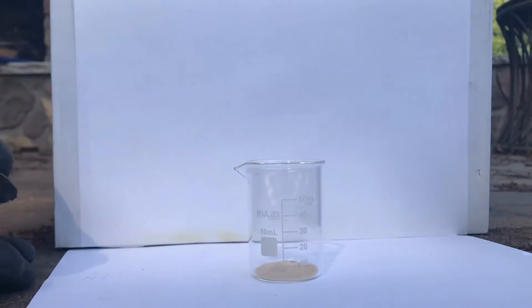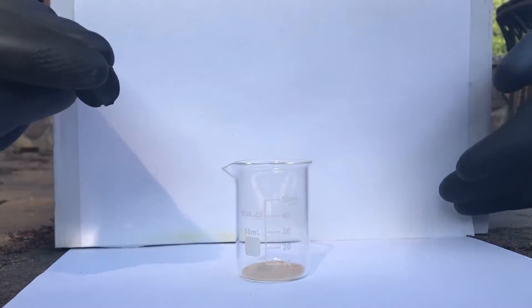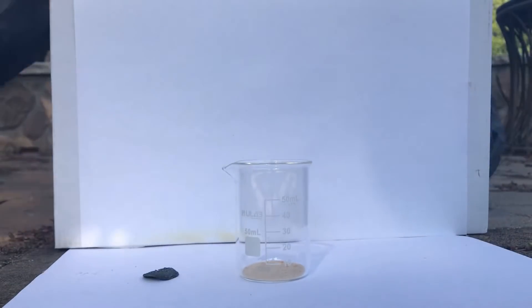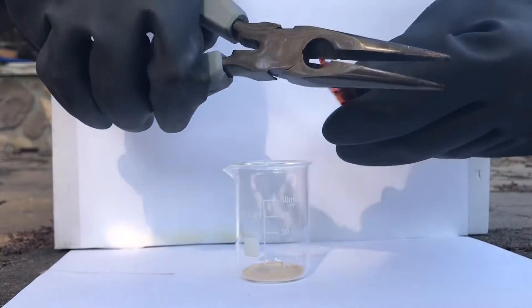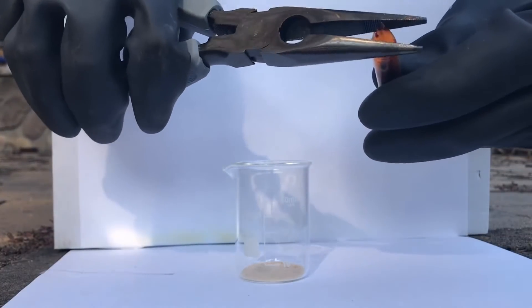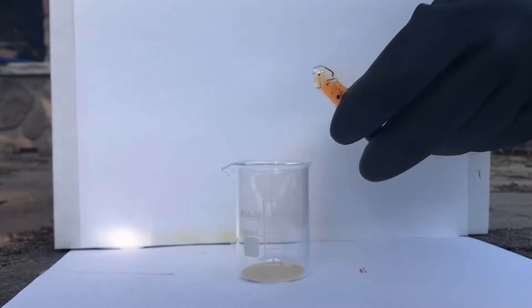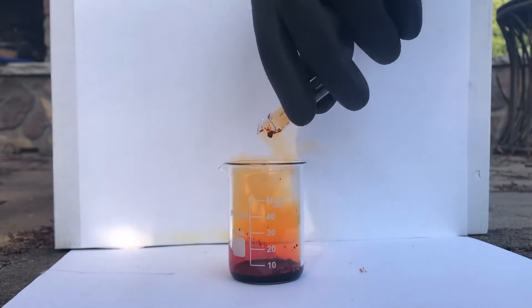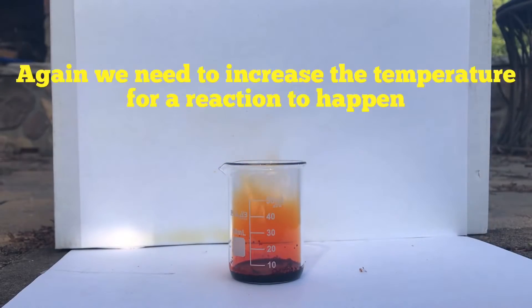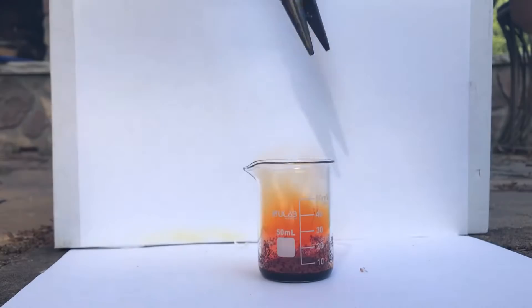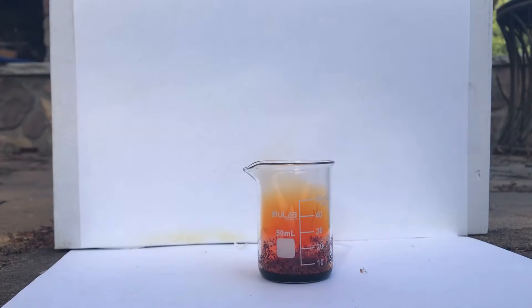Okay, so now we're going to react lithium metal, right here, with some bromine. Right here. Alright. Let's go. Obviously, the lithium did not react, so now we're going to have to light it on fire and then drop it in.